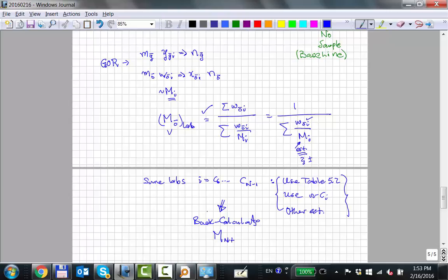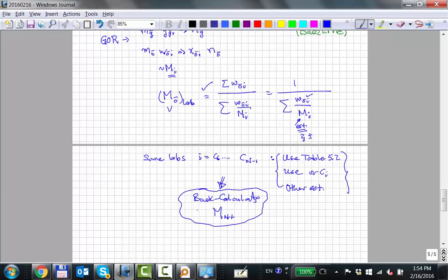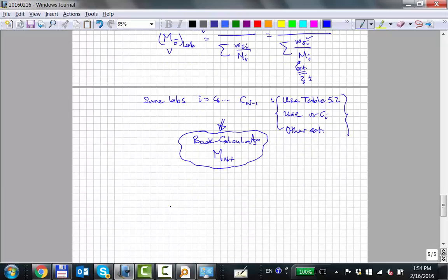So when the labs, I think it was back in the 90s, tried to do this, they got these crazy numbers. They gave a number of 3,280 for the C25 plus molecular weight. Numbers that were clearly wrong. So they stopped doing that. What they do today, we're not quite sure. I think every lab does it a little bit differently. So this is basically not used much or at all.